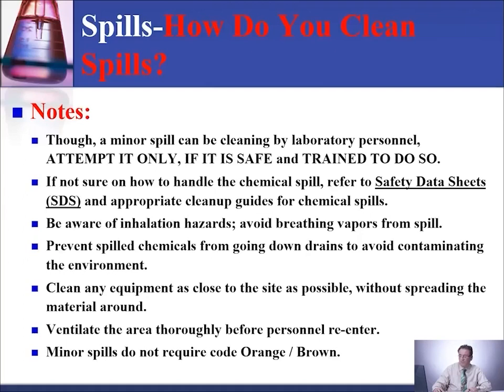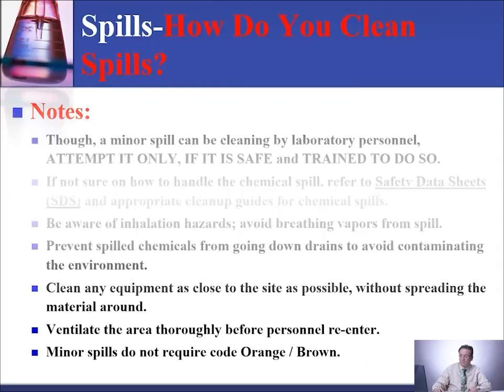Avoid breathing vapor from the spill. Prevent spilled chemicals from going down the drain to avoid contaminating the environment. Clean any equipment as close to the site as possible without spreading the materials around. Ventilate the area thoroughly before personnel re-enter. Minor spills do not require code orange or brown.